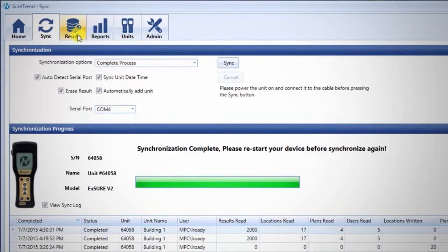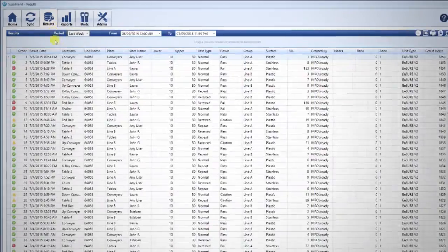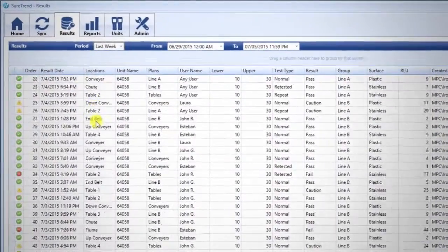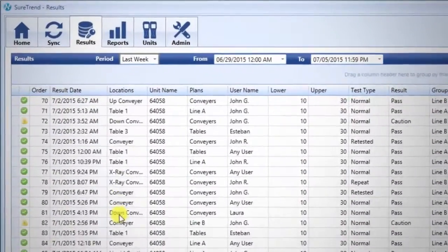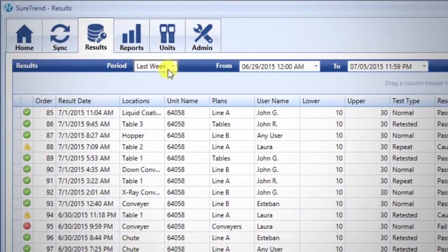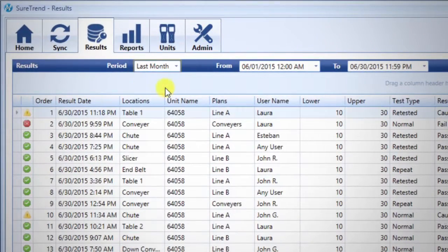To see your results, click the Results tab. Here you will see a complete database of all your test results.